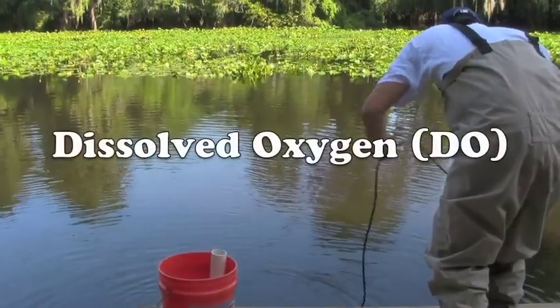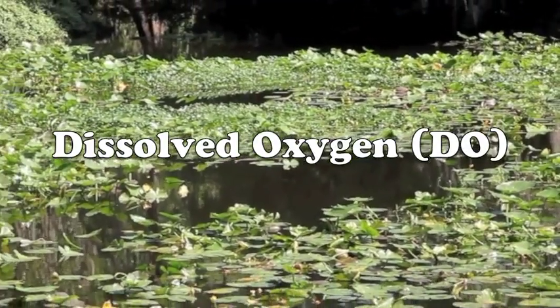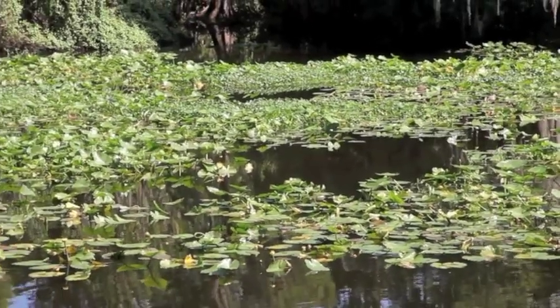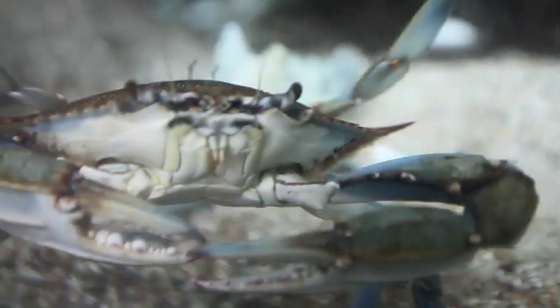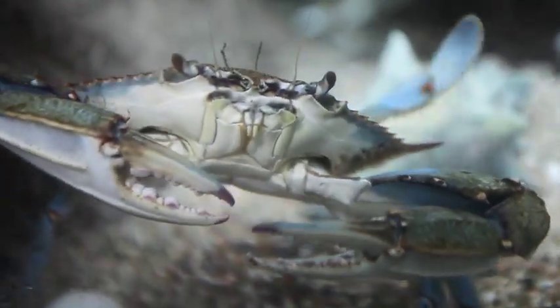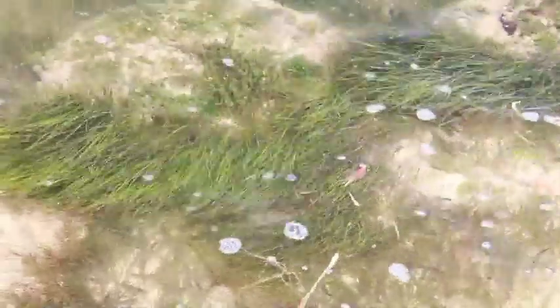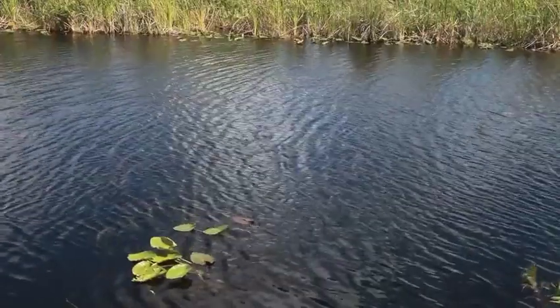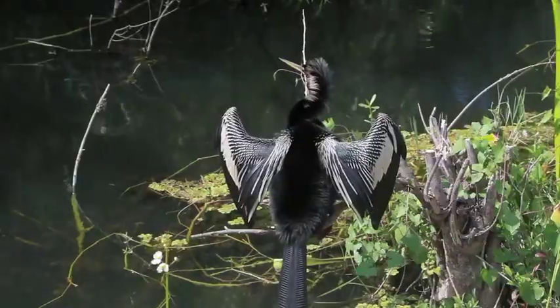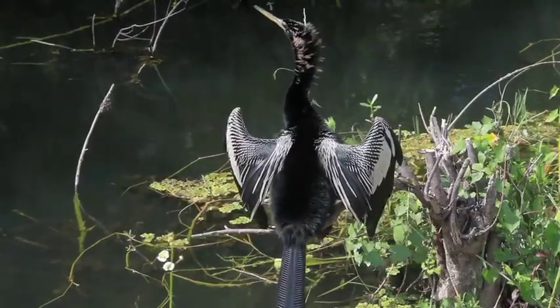Additionally, it's important to know that temperature affects dissolved oxygen, another parameter measured by the sonde device. Dissolved oxygen, or DO for short, measures how much oxygen is in the water. All aquatic plants and animals need oxygen, and they need DO levels within a certain range to survive. Most oxygen enters water during photosynthesis and from the air as wind blows across the water's surface. DO levels fluctuate throughout the day from changes in water temperature, bacteria, and photosynthesis, among other things.